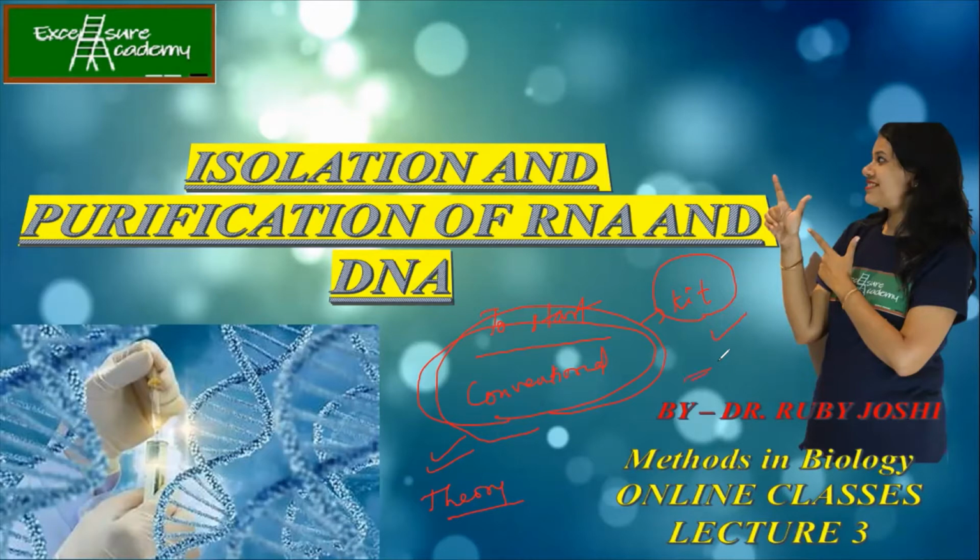Okay, so the theory, you know why we are doing such steps, for example why we were using phenol, why chloroform was used, why alcohol was used. Now you know why these chemicals were used. In the case of a kit, they are not named as phenol, chloroform or absolute alcohol. What the kit has is solution 1, solution 2, and they will not tell you which one is what. That is patented, and they will not reveal it. But you should understand that the first thing will, of course, be the phenol kind of thing, and second will be chloroform or alcohol. So like this, you will understand the steps. The basic concept does not change. It's just that they won't share the names and what ingredients are present.